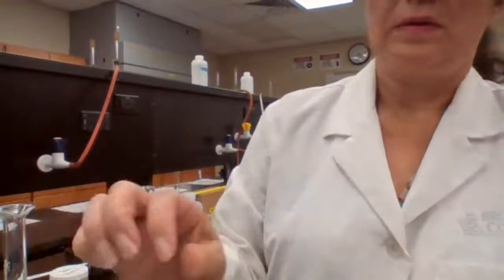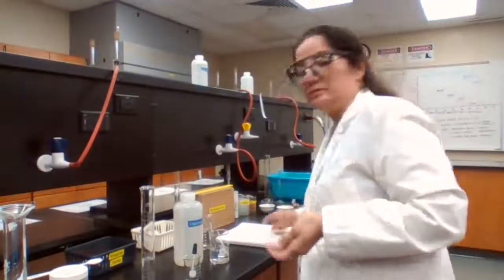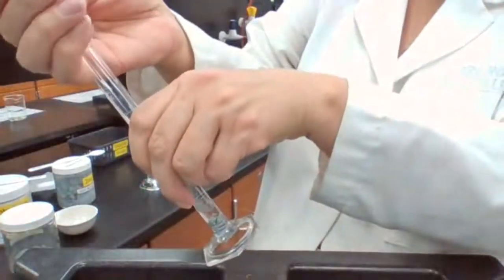6.76 milliliter is the volume before adding zinc. Then I add the pieces of zinc into the graduated cylinder carefully.